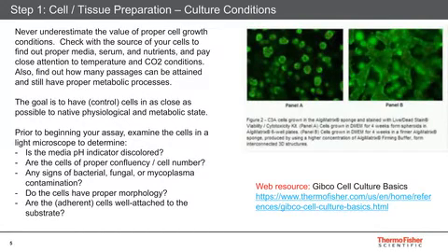First off, you want healthy cells. Never underestimate the value of the cells that you're imaging at the very beginning, right? So let's say you're culturing cells. You want to take a look at those on a transmitted light microscope to make sure that they have the right morphology, that there's no contamination, that their confluency is good. For many assays, you want perhaps a 30 to 60% confluency on a cover slip. If you're using tissue, you want to make sure the tissue morphology is good. And so you have to have proper media, serum, the nutrients, good temperature and CO2 conditions.